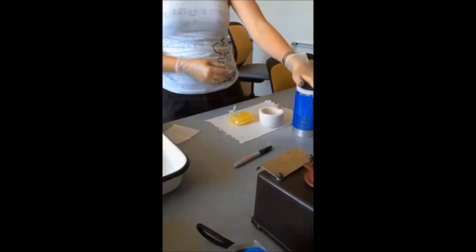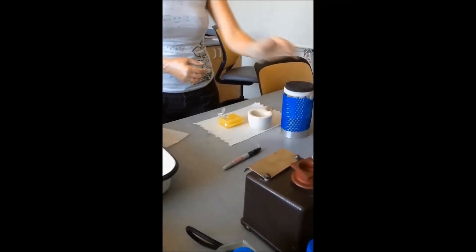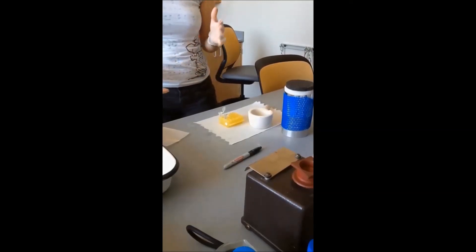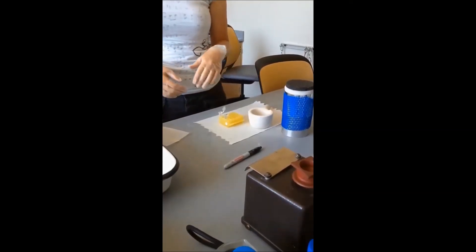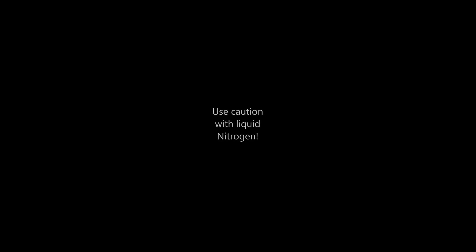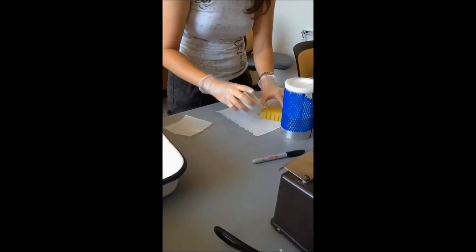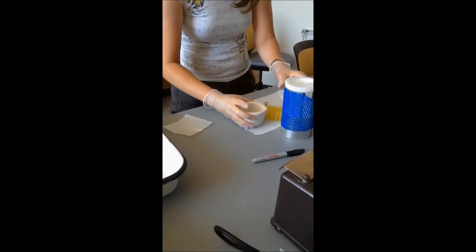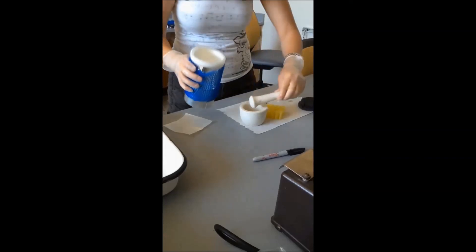And then we're going to save the powder in a minus 80 degree freezer for storage until we're ready to extract. And then our sample has dried.